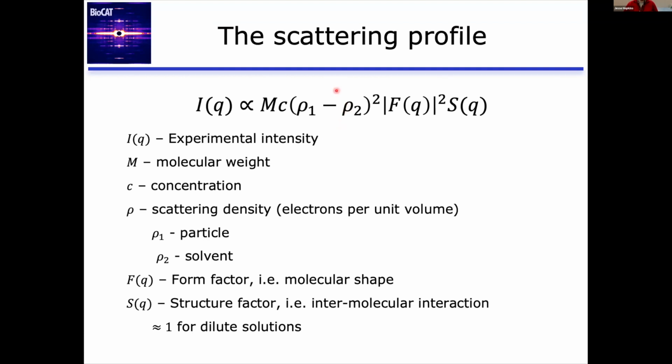And so you can actually utilize this in many ways to do interesting experiments. Most of those show up in small angle neutron scattering, and you'll hear about that on Thursday. But for our experiments, we generally want to try to maximize this difference so we get the best signal, which means keeping modest salt concentrations and avoiding other additives unless necessary. So there's the scaling factor.